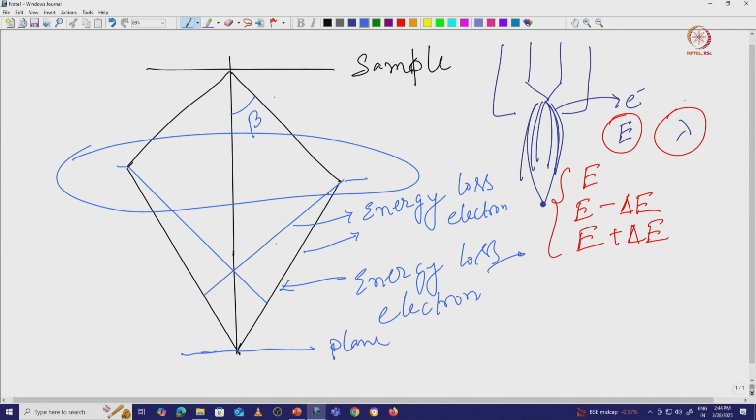So if we consider that some electrons are converged at one particular point, then at the actual image plane those rays will come and form an image, and that will give us some kind of blurred image. The images will not be that perfect, and it is going to affect the contrast as well as the brightness of those images. Now this is all about chromatic aberration, and if someone is asking, definitely chromatic aberration is also there in the electron microscope, in a different form.